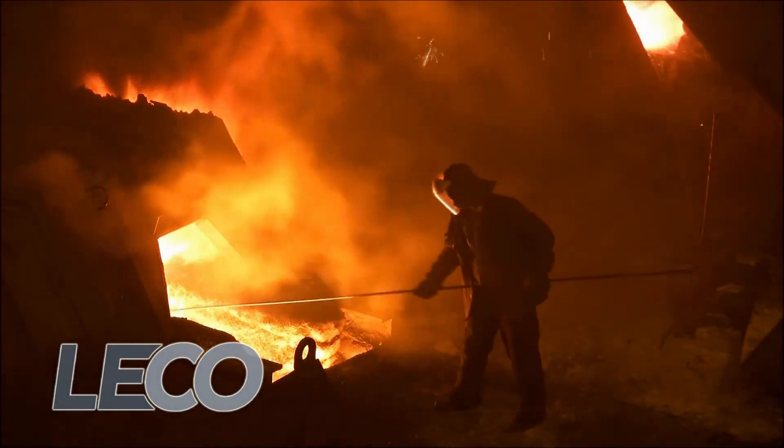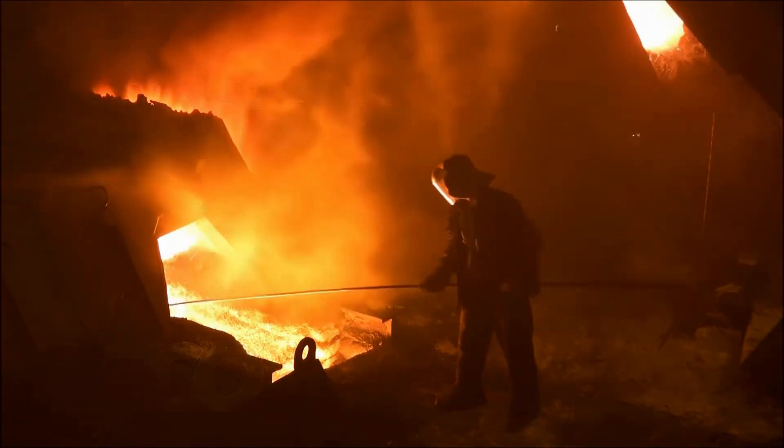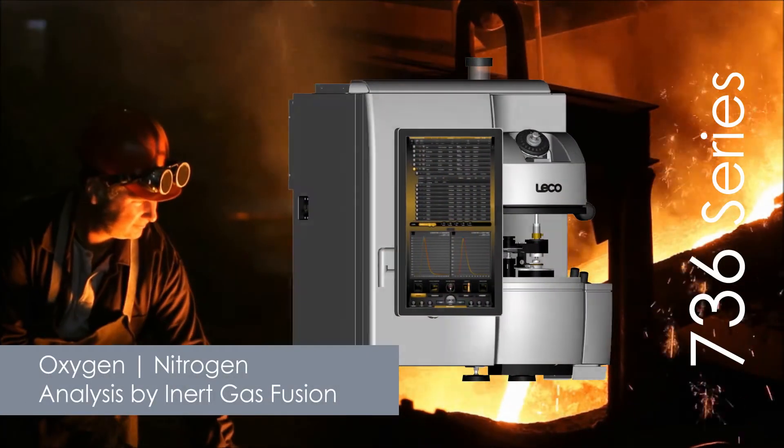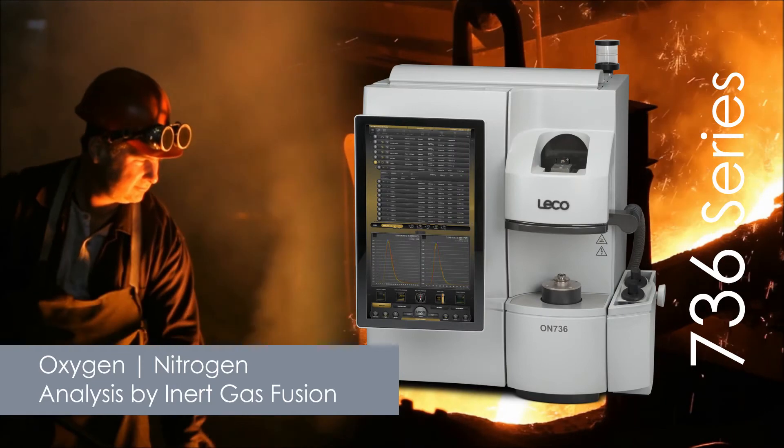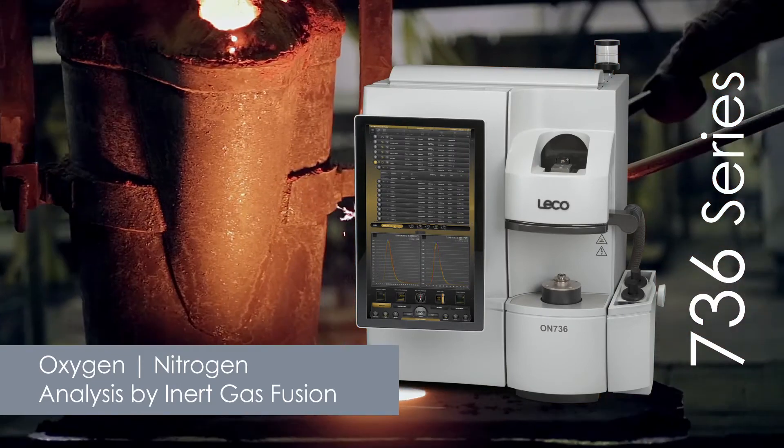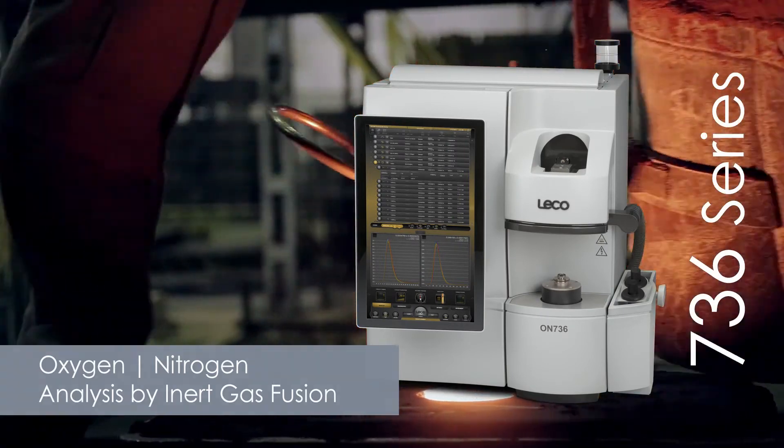LECO's 736 series was developed for accurate routine measurement of oxygen and nitrogen content of inorganic materials, ferrous and non-ferrous alloys, and refractory materials using the inert gas fusion technique.